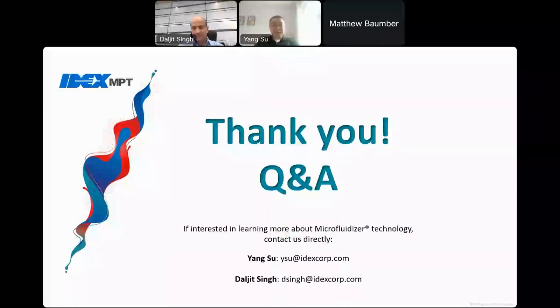I would say the uniform particle size is somewhat inherent from the technology and the machine design. Like I said, our constant pressure intensifier pump with the fixed geometry interaction chamber will achieve constant process pressure, hence will give you uniform particle size in processing. However, there are some parameters you can use to achieve a desired particle size.